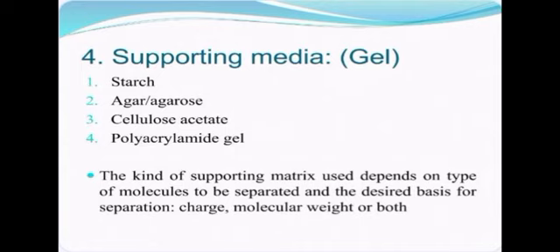The kind of supporting matrix used depends on the type of molecule to be separated and the desired basis for separation: charge, molecular weight, molecular size, etc. We separate the particles using a gel as the supporting media.